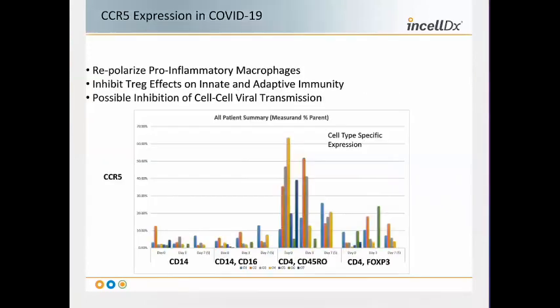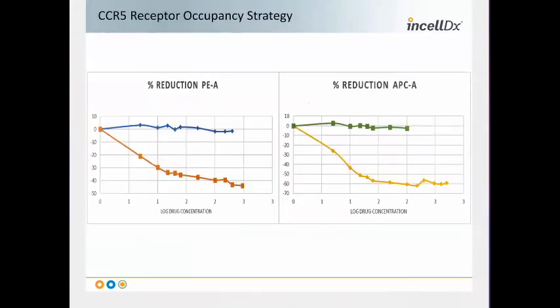But what is really essential is having a pattern you see like this. The blue line and the green line are CCR5 clones that are not blocked by drug. That is your internal control because the CCR5 levels differ depending on the time, depending on inflammation, depending on infection.